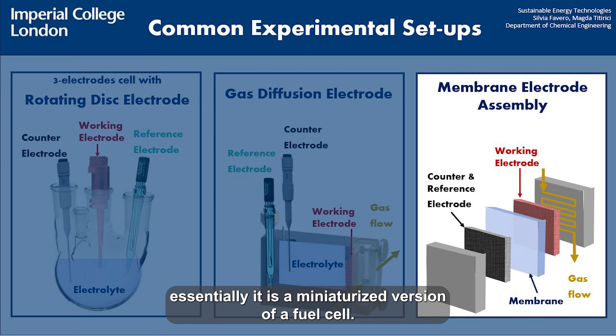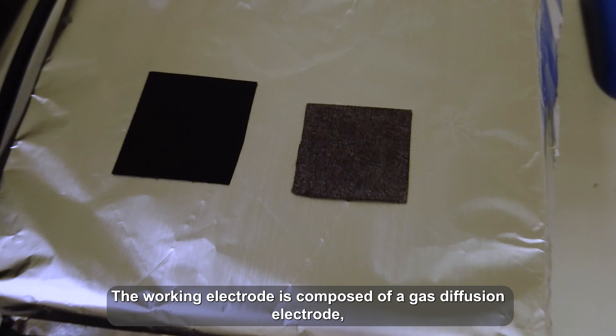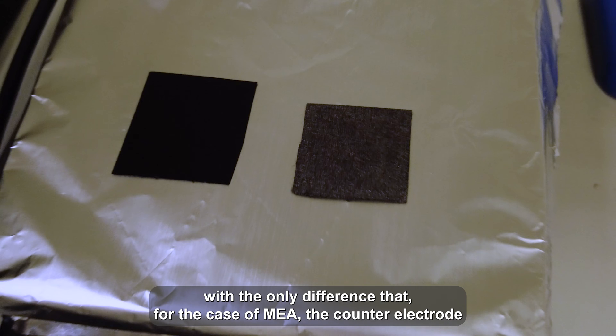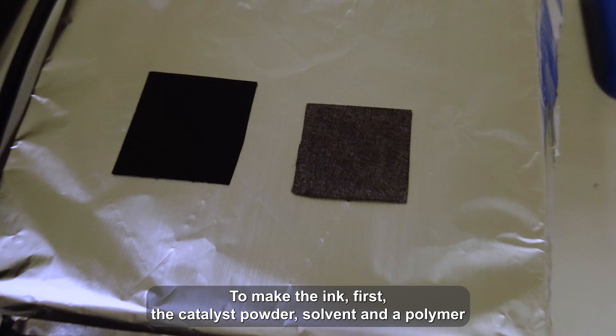Essentially, it is a miniaturized version of a fuel cell. The working electrode is composed of a gas diffusion electrode, generally carbon paper, where the catalyst is deposited. This is the same as for the GDE setup, with the only difference that for the case of MEA, the counter electrode is also a catalyst-coated gas diffusion layer.